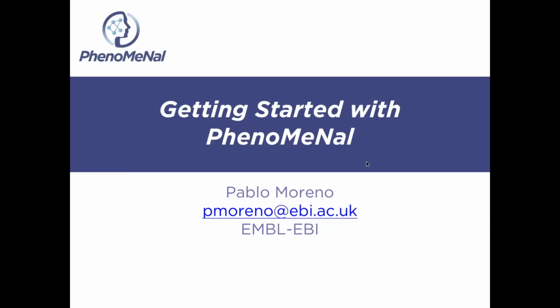And once we've done that, I'll go through an overview of the different tools and workflows that we have, to finalize with a demo where I will show the deployment to a cloud provider and the access to our public instance. I hope that you enjoy this presentation.